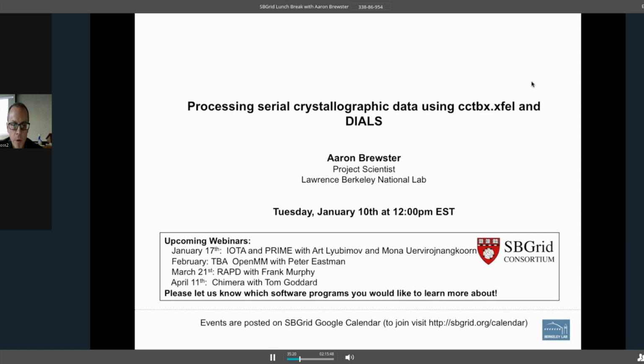I'd like to introduce Aaron Brewster. Aaron's going to be talking to us today about XFEL data processing with DIALS. Aaron is a project scientist at Lawrence Berkeley National Lab.